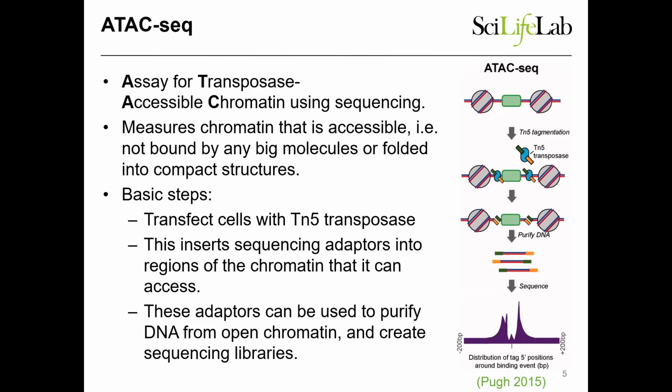And this works well. It's quite an easy protocol, and it works with very little starting material, including even one cell, which is what you want here.